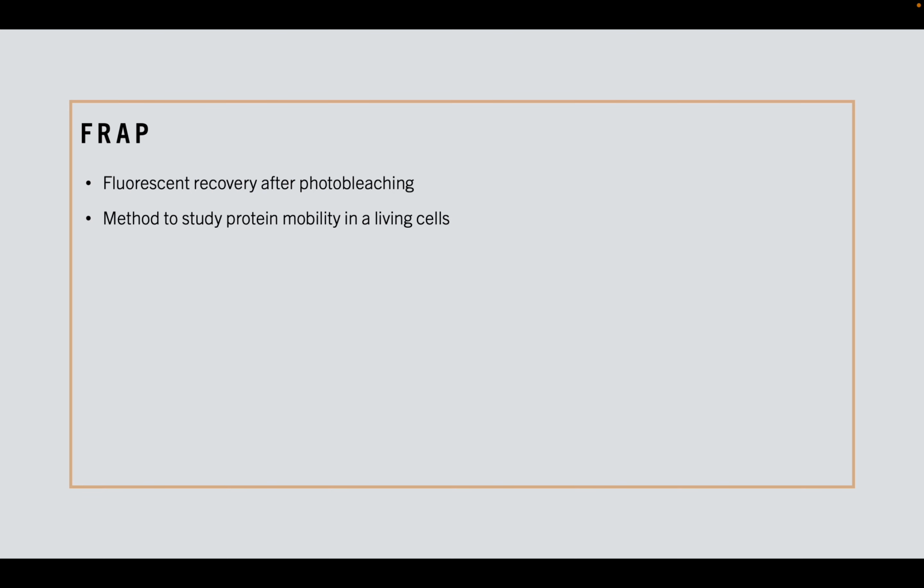And now I will talk about FRAP, which stands for fluorescence recovery after photobleaching. As the name suggests, what you do is photobleach the samples. What do I mean by photobleaching? Photobleaching is, as I explained, the fluorescence where you excite your sample with the laser light.